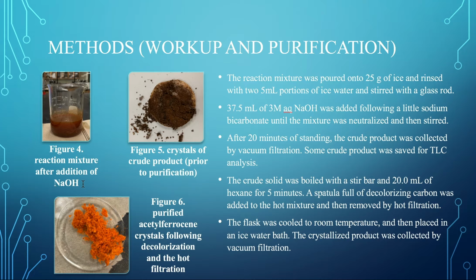So this is the reaction mixture after the addition of sodium hydroxide. After 20 minutes of standing, the crude product that you can see here was collected by vacuum filtration, and a little bit of the brown crystals were saved for TLC analysis, which was before purification.